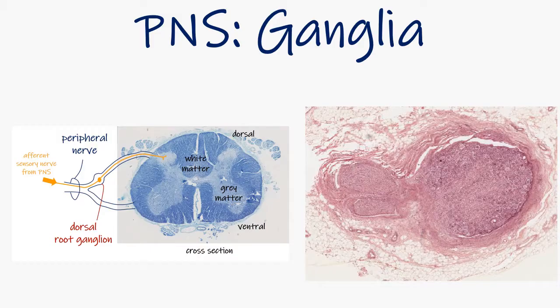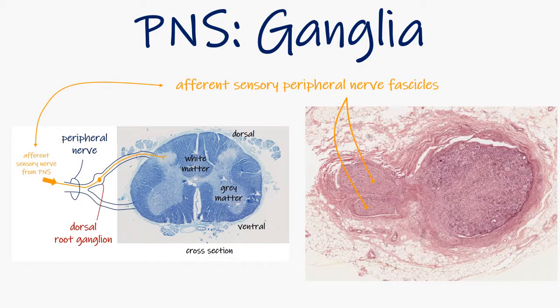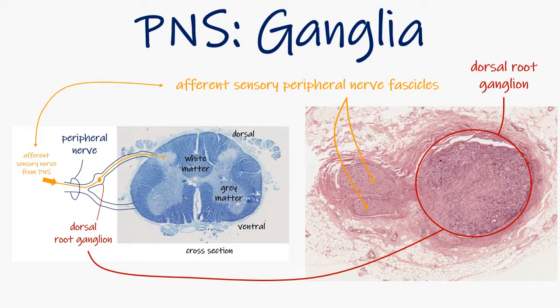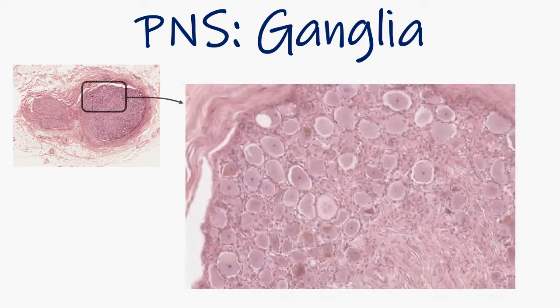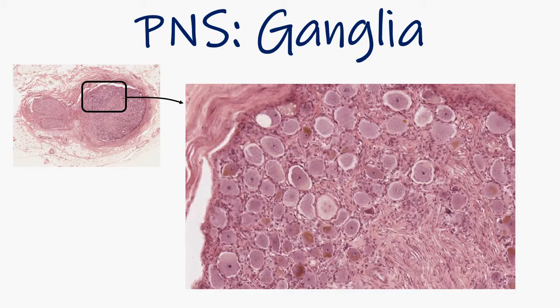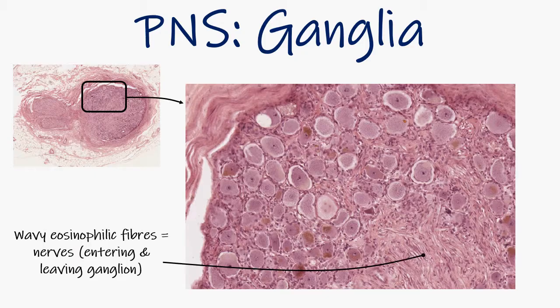Finally, let's take a quick look at what a ganglion, a collection of nerve cell bodies, looks like. If we compare the schematic on the left with the light micrograph on the right, we can see fascicles of afferent sensory nerves entering a dorsal root ganglion, and then we can imagine them synapsing and traveling on to the spinal cord. If we magnify a part of this ganglion, we can clearly see the wavy fibers that are composed of afferent and efferent nerves entering the ganglion, and then we can imagine them synapsing with the beautiful large neuronal cell bodies, a few examples of which are circled here in blue.